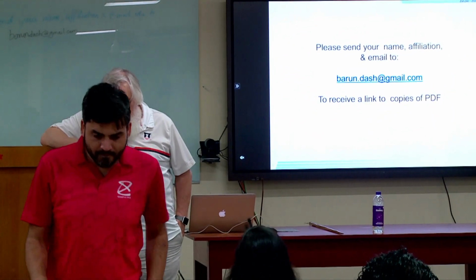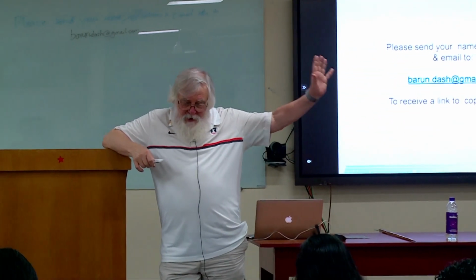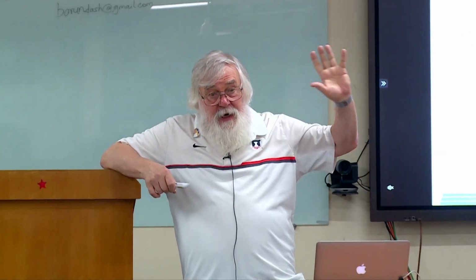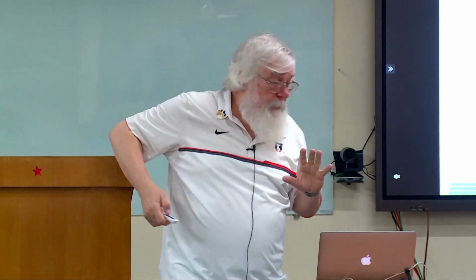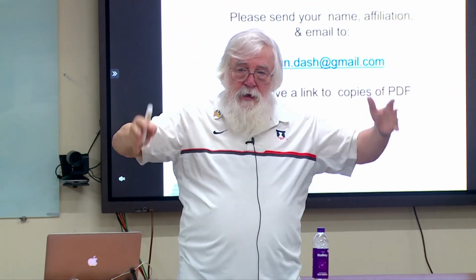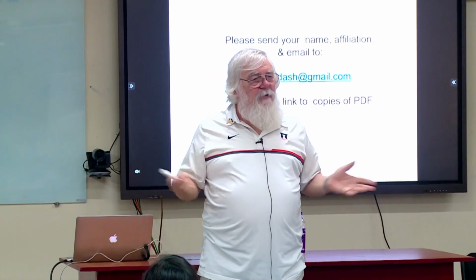We spent a lot of time talking about sources. Well, we talked a little bit about microscopy, a little bit about sources, a little bit about lenses. Now there are other things I want to talk about in terms of the instrument, and we're going to carry on with that. Okay. The next thing I want to talk about is we had a lens, we have a beam. We had that beam come down, go through some lenses, and come down somewhere else. All right, but that beam is never perfect.